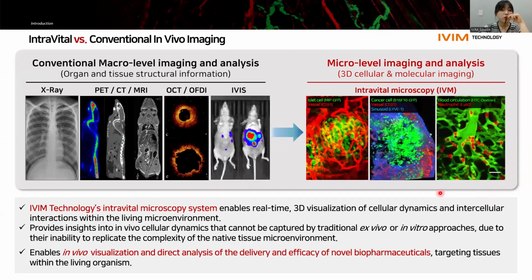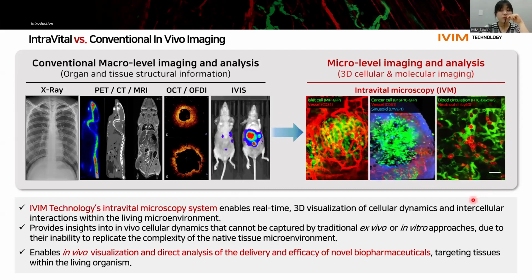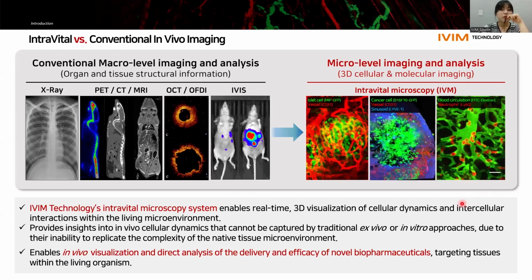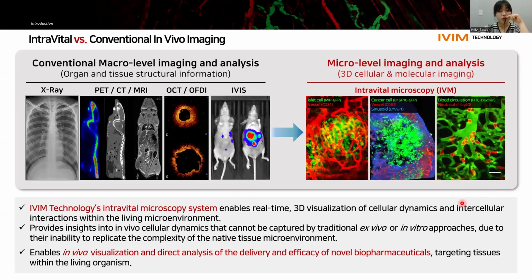This includes not only dynamic cellular behaviors in their native microenvironment, but also real-time visualization of how novel biotherapeutics, such as antibody-based drugs, cell therapies, and gene therapies, are delivered to their targets and act within the body. This capability enables true in vivo drug testing directly at the site of action.